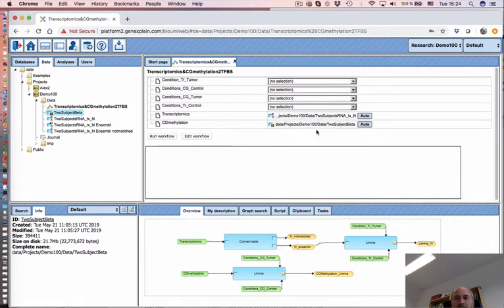Here we put methylation, here we have transcriptomics data, and then we can select multiple conditions by pressing these buttons for the tumor and for the control. But the only problem I see is that the order of those input values is not optimal, so we should probably reorganize it a little bit.